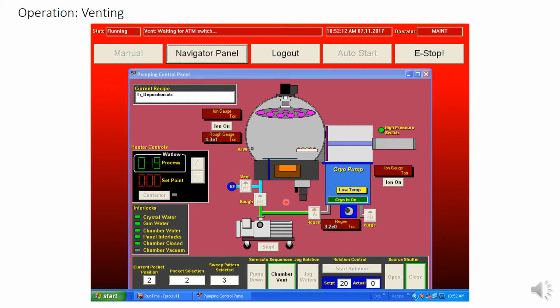This will stop automatically on its own. The blue T section will go gray. Another way to know if a process is still running is by looking at the top left where it says state. Here it's shown as running. Otherwise it will simply say none or OK.